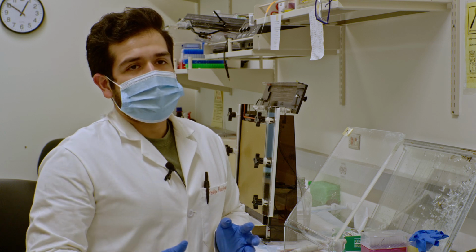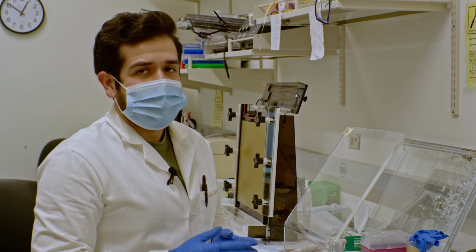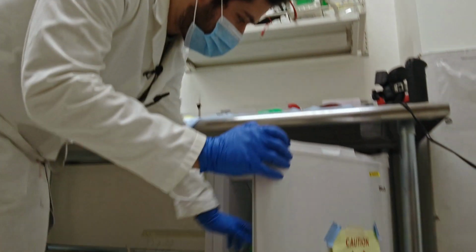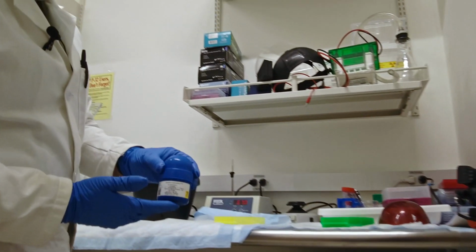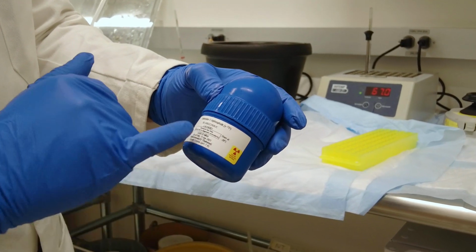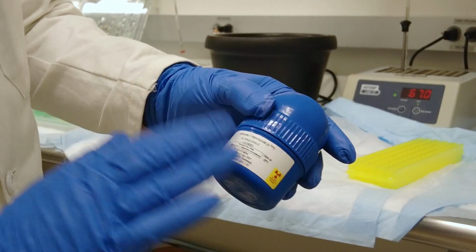What we do here is in this 20 microliter volume, we add 1 microliter of radioactive ATP, which is about 24 microcurie. This radioactive ATP is found within this freezer here. It comes in this blue container, and we purchase ours from PerkinElmer. Make sure to note the lot as well as the expiration date and the date that you actually got this, which should be on the label.